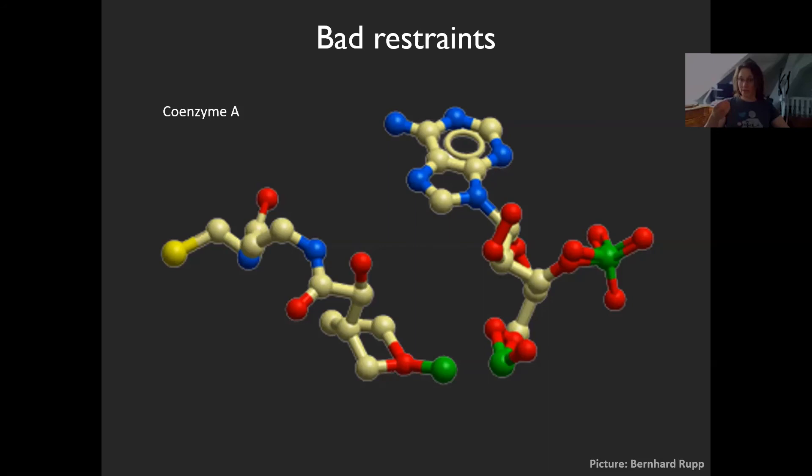The third danger is bad chemistry. If you have bad restraints or no restraints, Coenzyme A can look distorted — for example, two atoms occupying the very same space. You should also be aware this can happen to your protein — things like cis peptides — and you need to find and cure them.